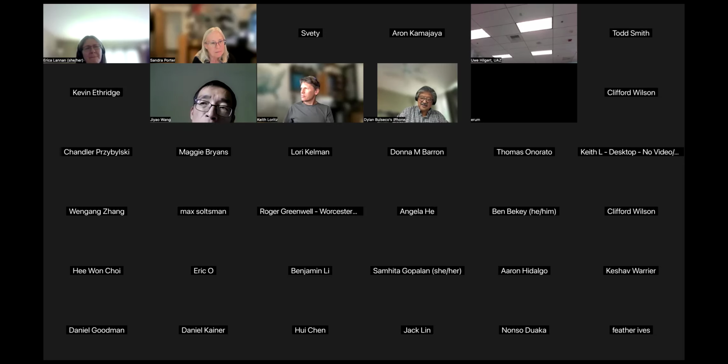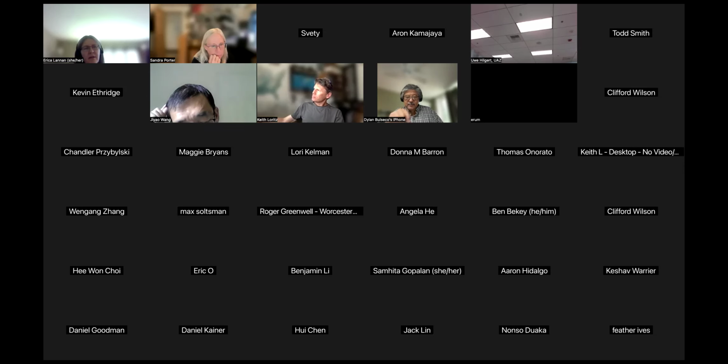I think you are more talking about the BLAST page, right? Are you coming from BLAST or are you working in iCn3D? I'm using iCn3D, and what we do is the align and then the sequence to structure. And then there's an accession number that we put in there. Okay. Yes, that's a good point. For your input ID, you need to find a template, and your input might be a nucleotide.